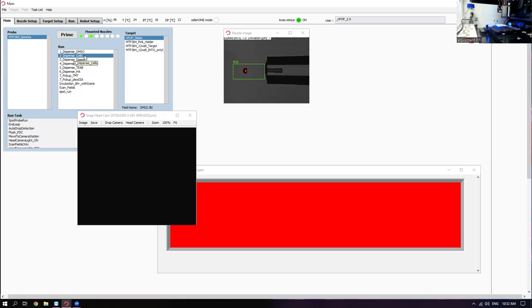So this is one of the reasons why we have our two PNCs. We keep cells separate. Andrew believes very importantly that having the cells in a different nozzle than everything else really makes the process more robust, and it certainly makes the pickup much more high throughput. Half the number of moves you have to do to pick up to your plates.